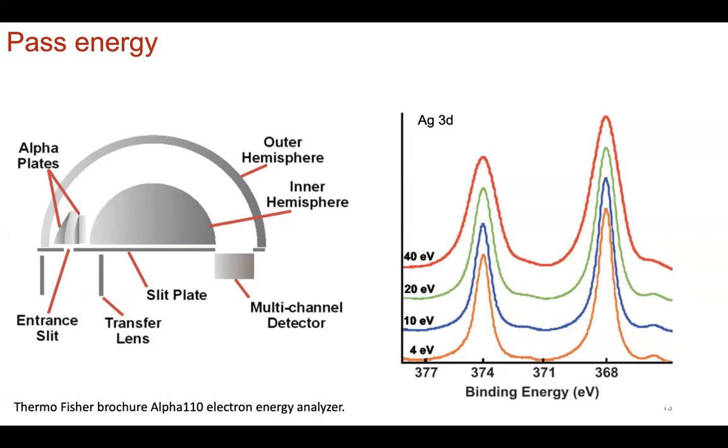This can be a 1-hour scan, and depending on how this looks, this could be averaged over 3 scans, and that's what you should do. But if you're just trying to get information about species identification, then you could do like a 15-minute scan at lower resolution and just pass through before you spend more time in getting high res data. You can also go as high as 80 eV to get, let's say, a survey spectrum.